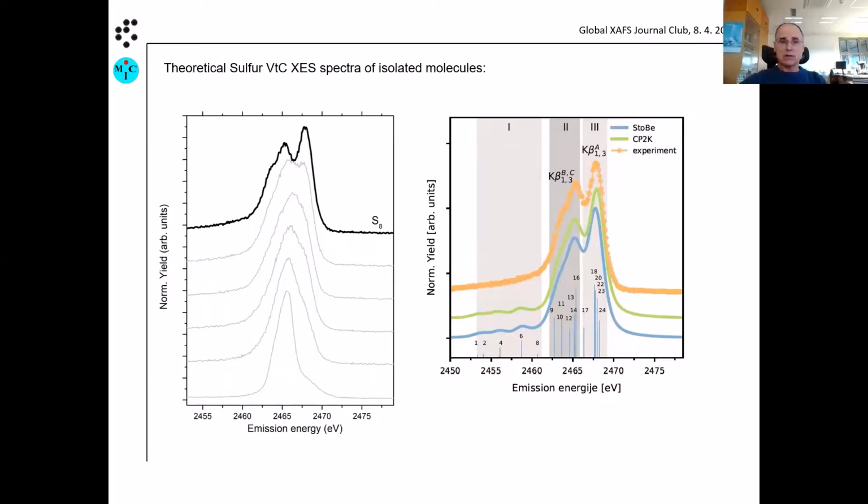So we start with just regular sulfur, and you can see on the right a calculation. This is a DFT calculation for an isolated molecule with 2 different codes. This is the work done by Marco, and also Avareich, our new PhD student, is now entering here. You can see we can reproduce this spectra, I would say, very well. It's as good as you would want. I don't think we need anything much better.